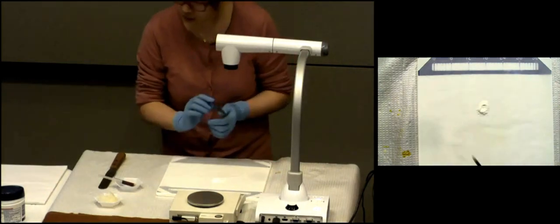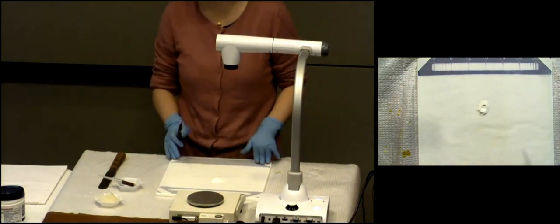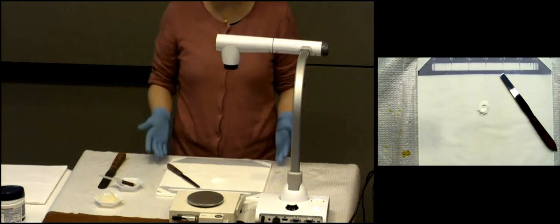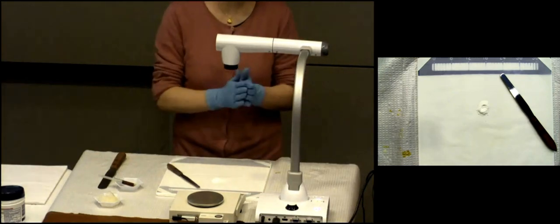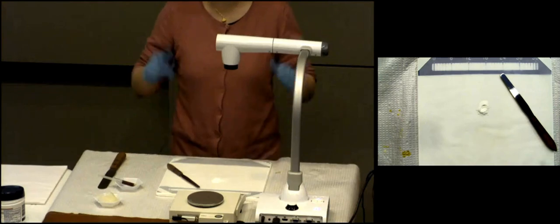I forgot about that. So first of all, when was the last time you had to use parchment paper? When you made capsules. So when you made the capsules, you used this parchment paper already. One more time. For me, I have to use an ointment slab underneath it because I have a little diaper here, which is too soft for me to do spatulation. You don't have to do that. You can tape down a piece of parchment paper on your bench directly.